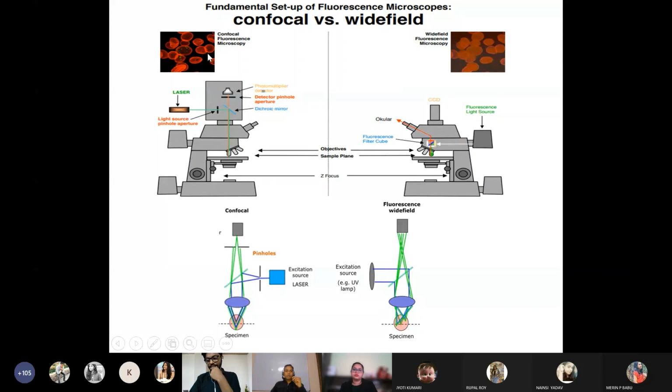So this is actually a localization experiment, where the green dots may be some of the proteins which are fluorescing inside a cell on the organelle. So sometimes it is very critical to find out whether these green dots are distinct or not. So what is the reason that the quality of image is very much different?